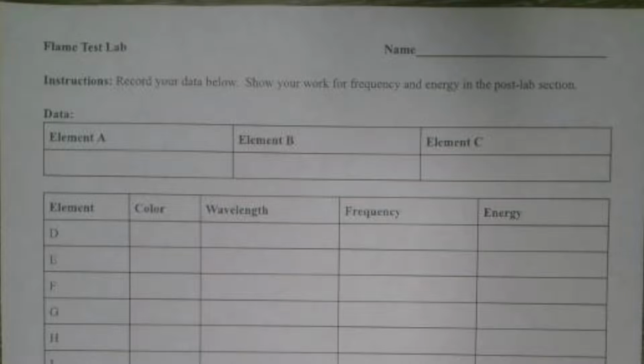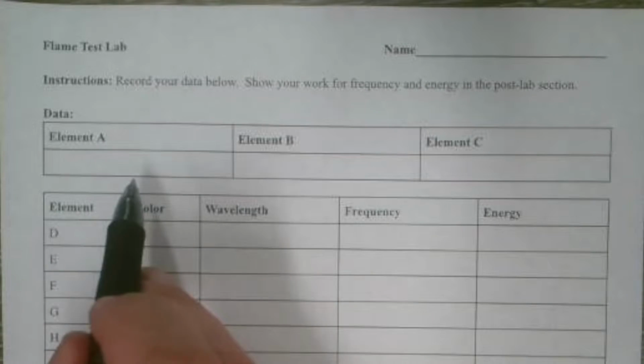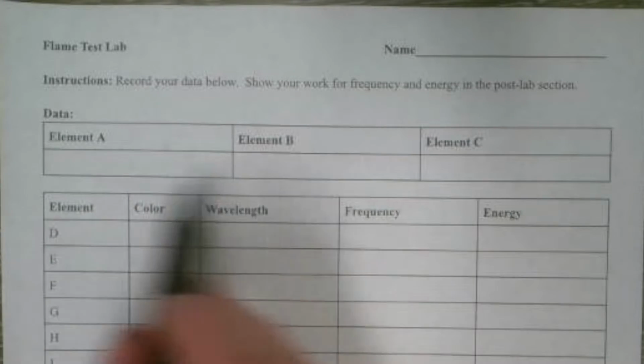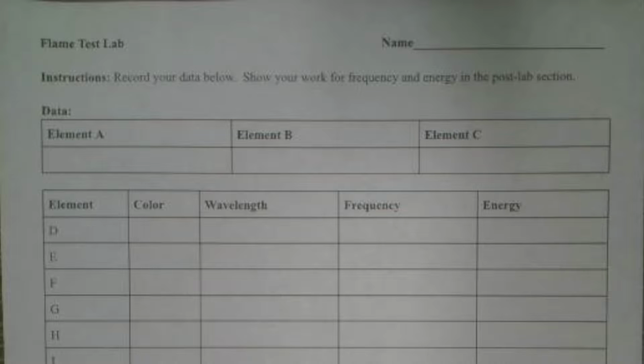So in the flame test lab, we're going to do a couple different things. We're going to look at the emission spectrum of different elements, and then we're going to look at the color of light that certain elements release after being exposed to a flame. This first part would be the emission spectrum part. And for turning in this handout, I'm not really concerned with this part, but I'll show you what it looks like.